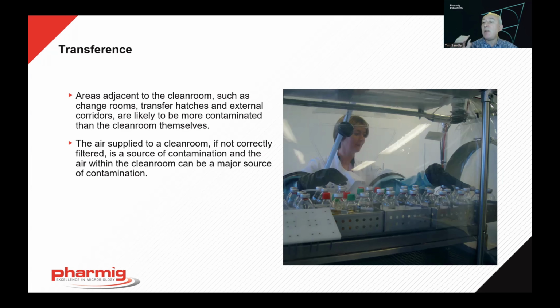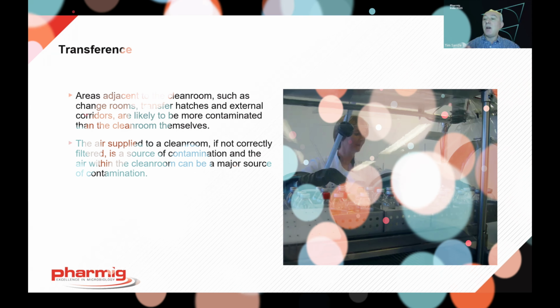We need to understand where our different wrappings are going to be removed. Where should we be applying different types of disinfectants? Where do we make sure there is no outdoor packaging coming in? How do we ensure that items are correctly dry? These are all fundamentals that we need to use risk assessment to help us to answer.